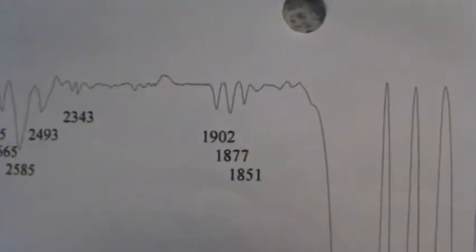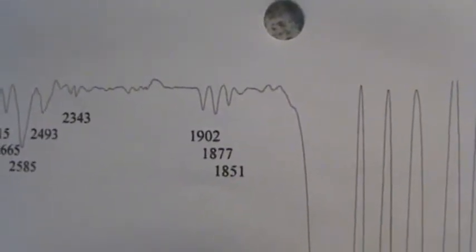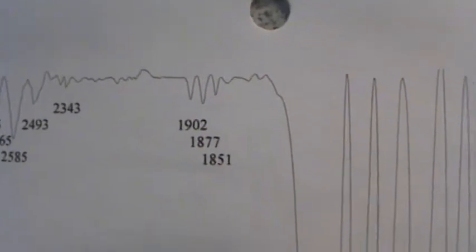Para-substituted. You're only supposed to see 1 peak between 800 and 850. There's 2, of equal intensity. So I don't know which one is which in this case. I can't label it. Yes, I know one of them is, but I don't know which. The overtone for that from your Pavia book shows in the overtone region here, you're only supposed to see 2 peaks. I see 3. So I can't label that either. So I think we're pretty good for that one.